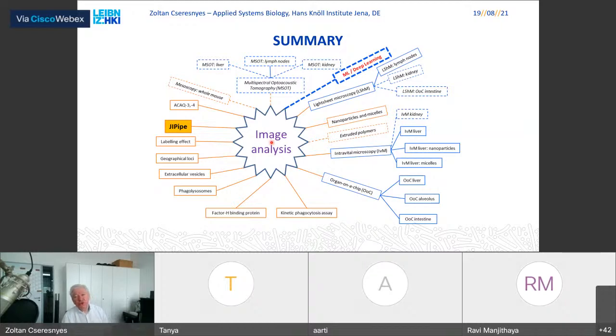Yes, and that's what we usually do, actually. The experiments that you saw had antibody labeling of the macrophage as a control, but the actual image data that served as the basis, for example, of those two studies which I showed you, were done exactly that way, where the macrophages were not labeled, but the fungi were either genetically green fluorescent or labeled with FITC. And then it was in the same experiment that we did unlabeled and labeled. Yes, it's a very good question.